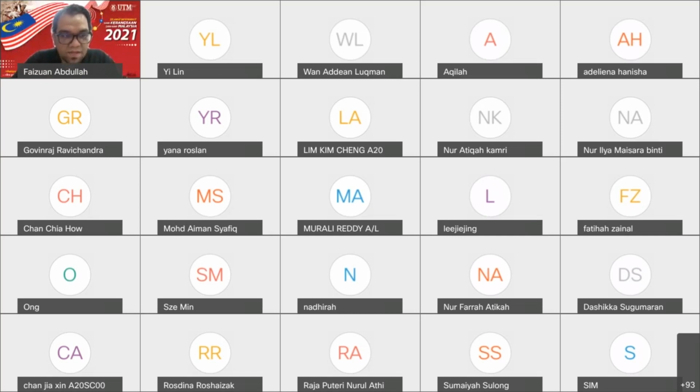Let's say I have prepared 1000 ppm of the stock solution, and I need to prepare 100 ppm of zinc solution in a 100 milliliter volumetric flask from the 1000 ppm stock solution.